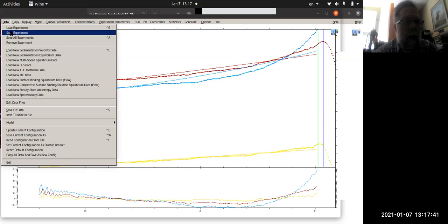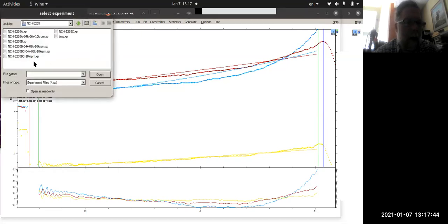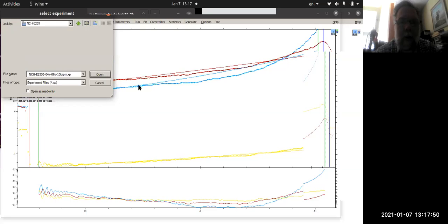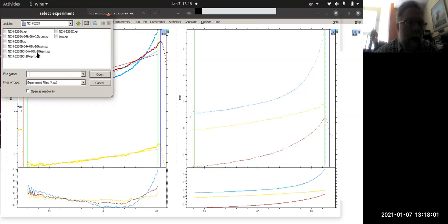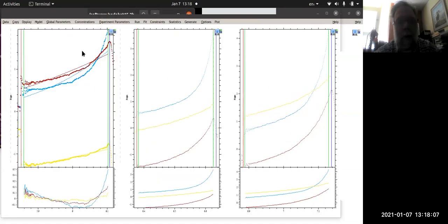The nice thing is that if you want, I can load in a second set of data, which is, where's column B? So 3 speeds of column B. This is a different experiment now with a different loaded concentration. I can load up a number of these different data sets. I did this experiment 3 times with 3 different speeds in 3 different concentrations, and I called them A, B, and C. Now they're labeled as experiment 1, which is A, experiment 2, and experiment 3. All 3 of them have different concentrations of material in it. But in each window, it's the same total loading.